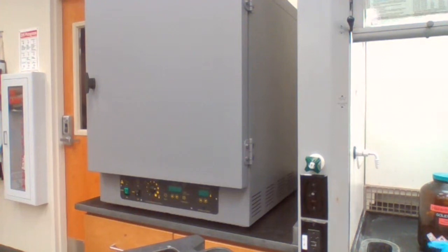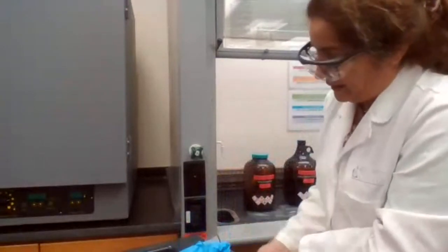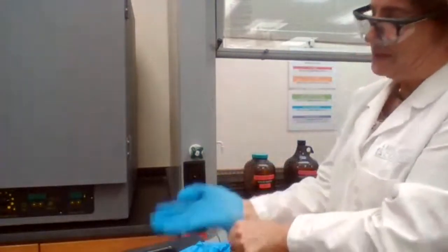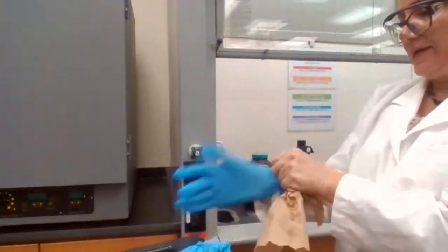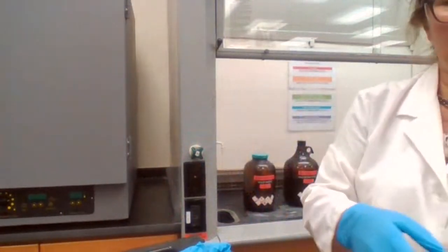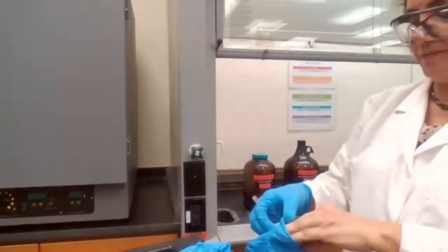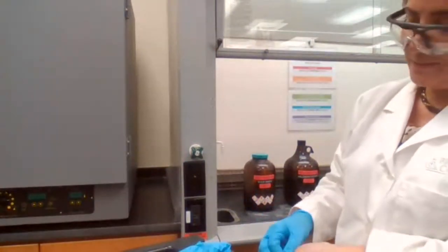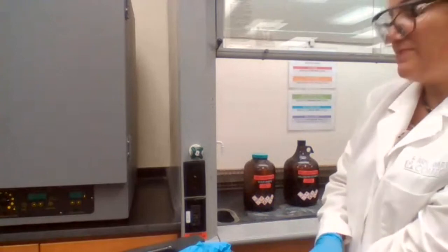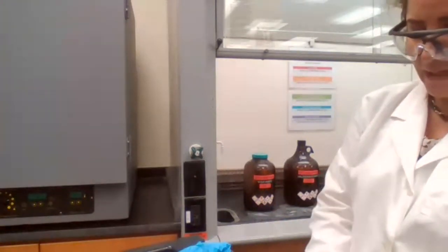The general rule for using gloves in the lab is that when your gloves change color, it's time to change your gloves. So when you see yellow color on your gloves, that means that you have touched acid or base or something that should not be there on your hand, on your skin.